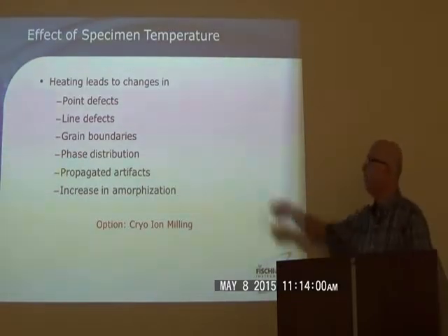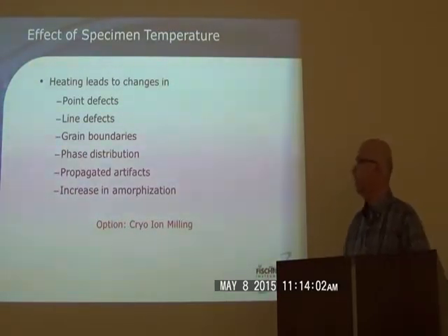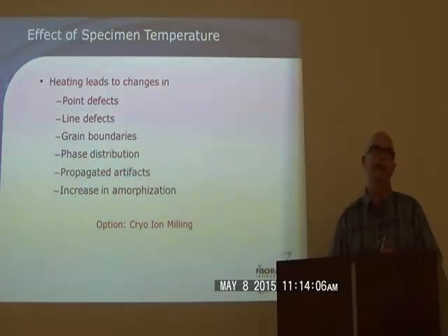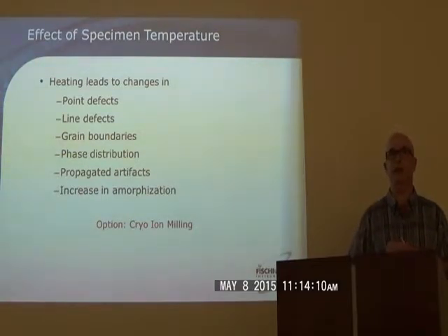And just following up on this, in terms of specimen temperature, how do we cure it? Well, our company is a strong believer in cooling the sample, and that's why you'll see a liquid nitrogen container on most of the ion mills that we produce.